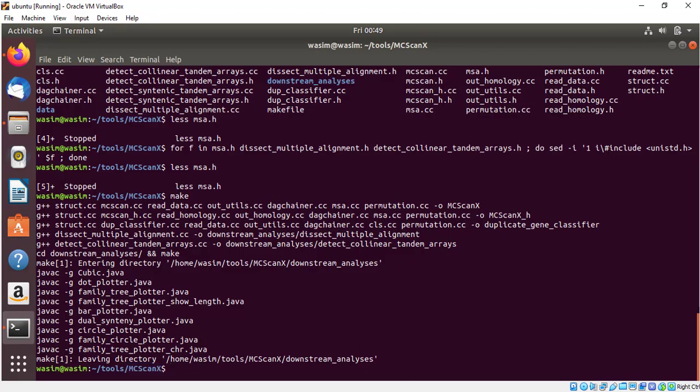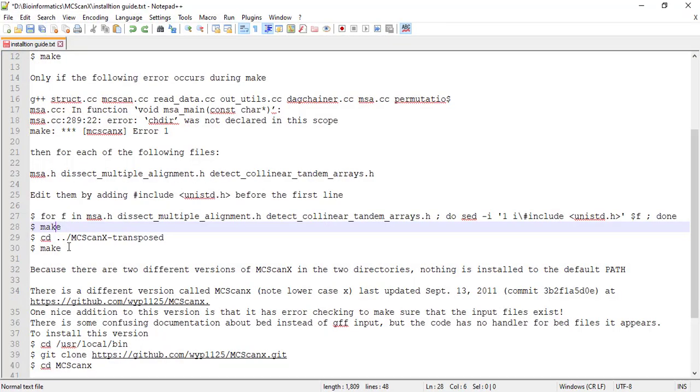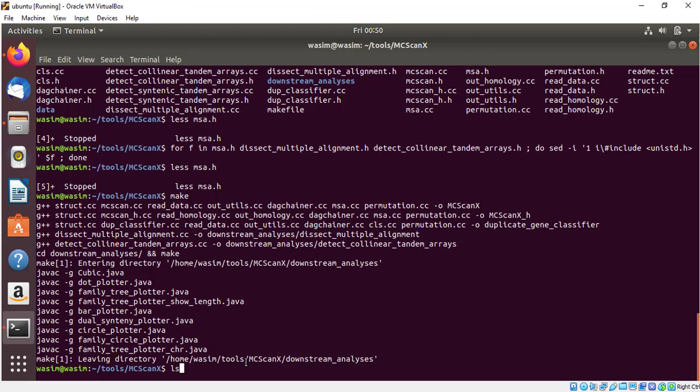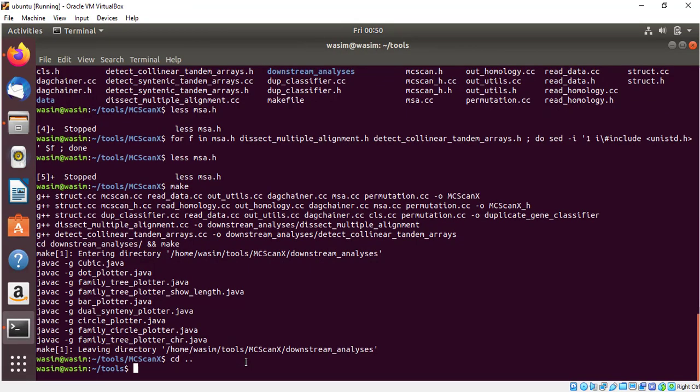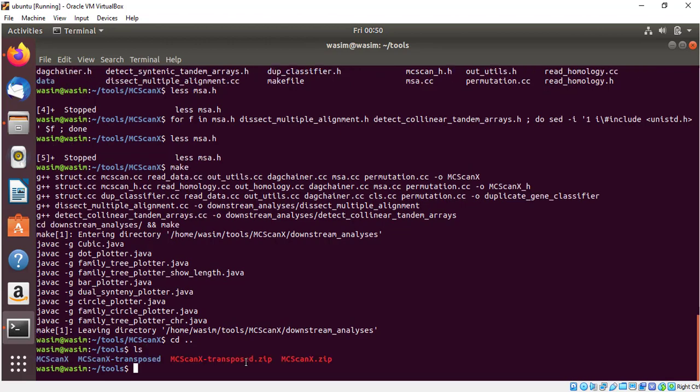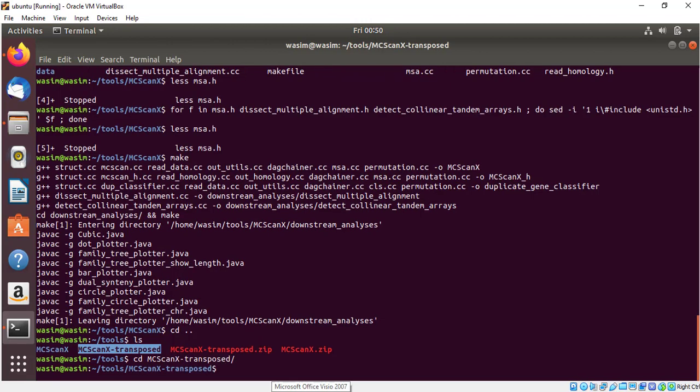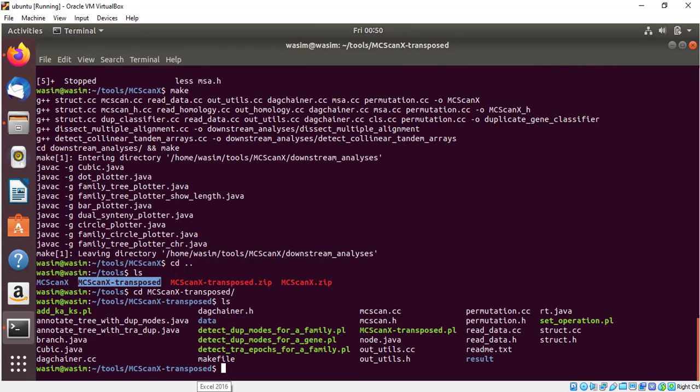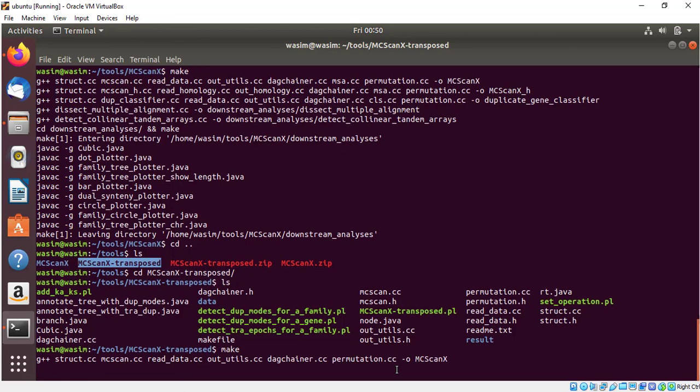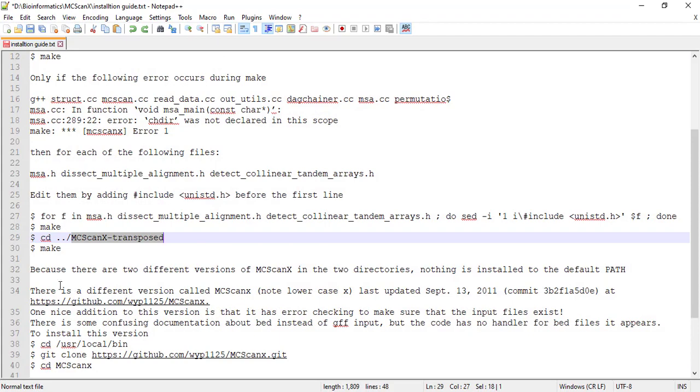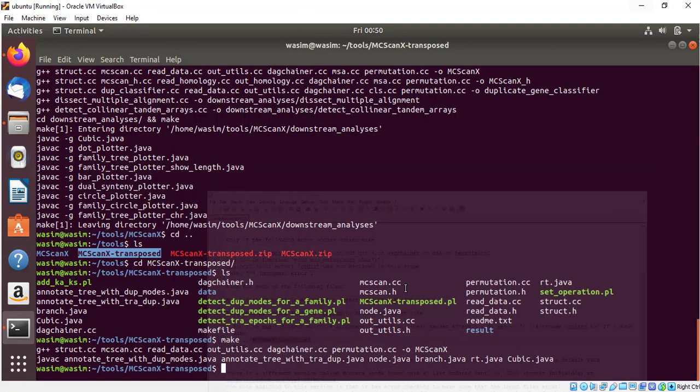In the next step we need to install MCSCANX transposed. Just go to that folder, exit from this folder. Type cd dot dot and now you are out of MCSCANX folder. Now we will enter MCSCANX transposed folder. Type cd MCSCANX transposed folder. Now we are in their folder. Now here type make. Wait for some time to install. Now it's installed. Our program MCSCANX has been successfully installed.